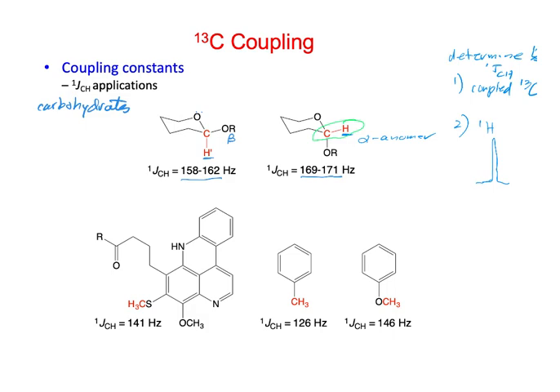This would be the protons that are attached to the C12s.